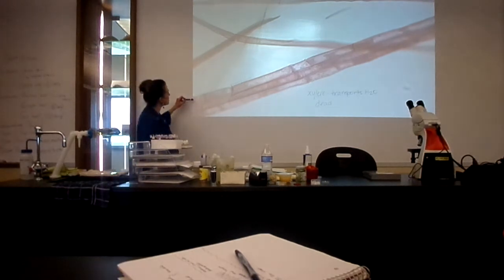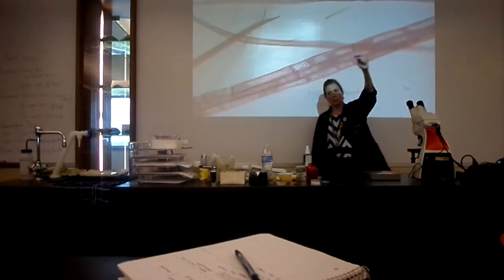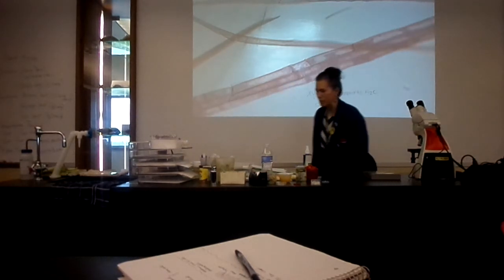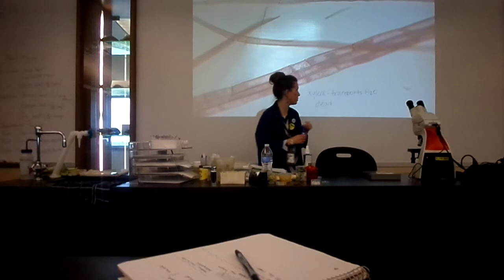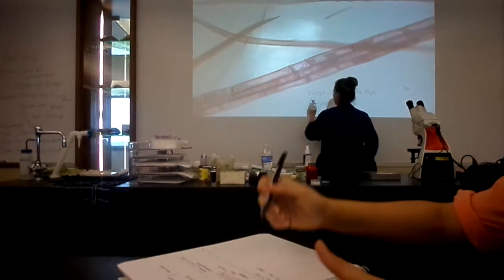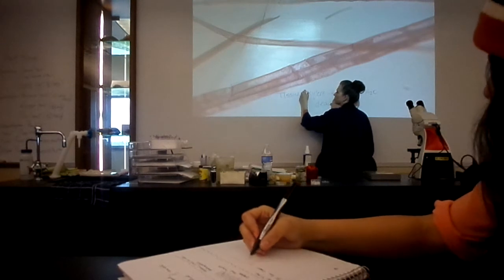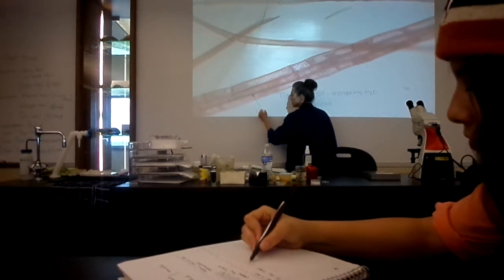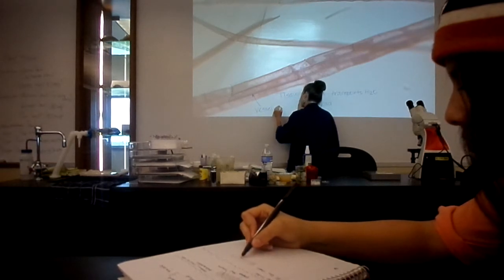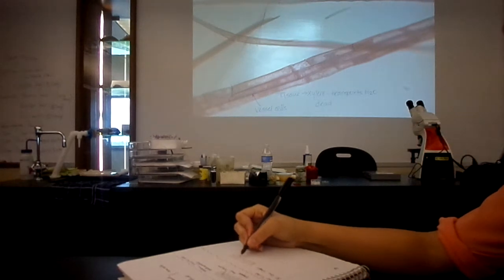All right, this is a series of tubes. Water will pass through the tubes this way, up the plant. All right? The cells that you're looking at, they are called vessel cells. So the name of the tissue is xylem. These cells are called vessel cells. They're the wider of the two cells.